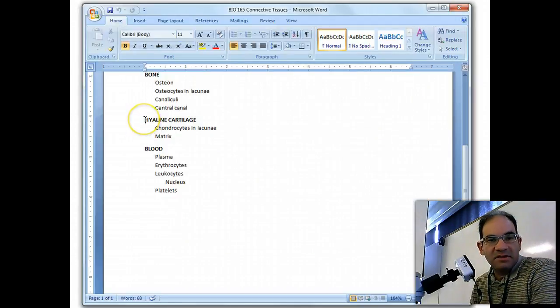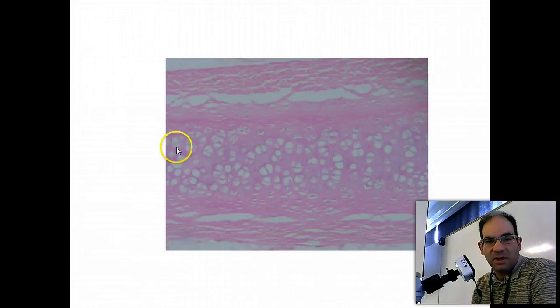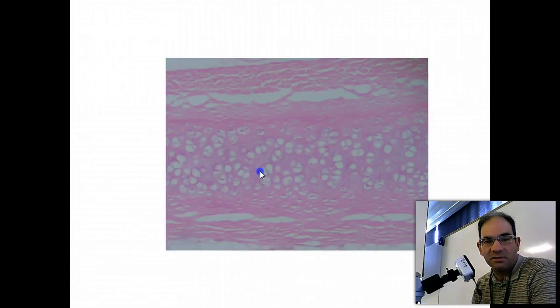Our next tissue type is hyaline cartilage, and you're responsible for chondrocytes in lacuna and matrix. So here we are at 100x, and you can see this nice band of cartilage right through here. And each of these little spaces is your chondrocyte in its lacuna. And the pink surrounding the spaces is your matrix.